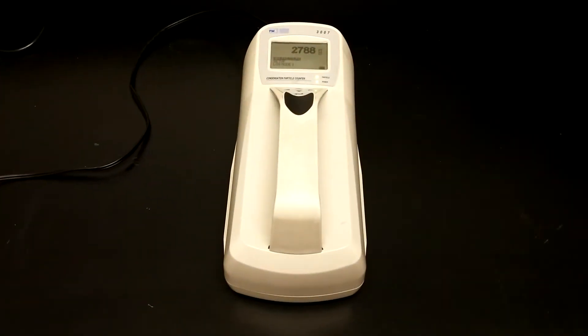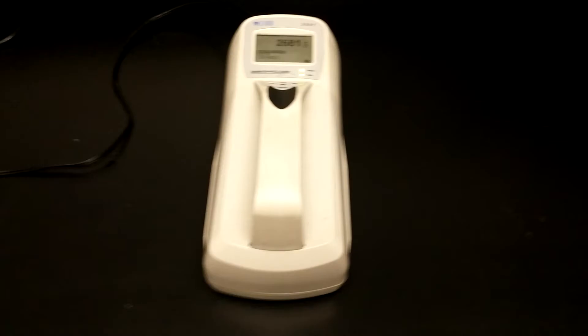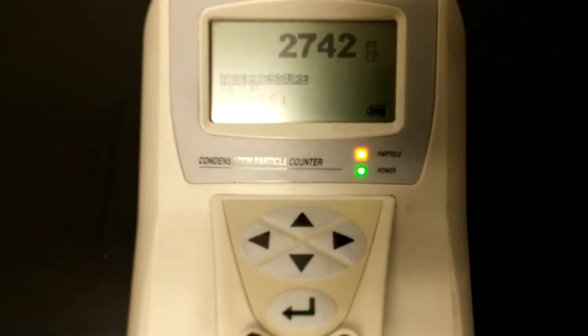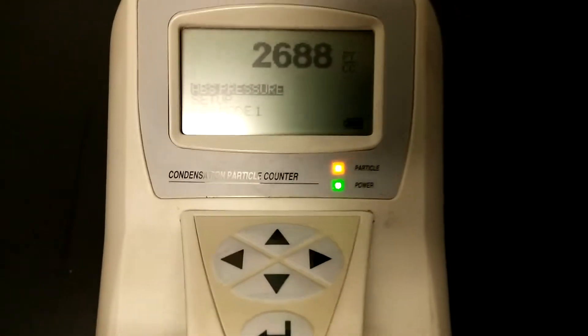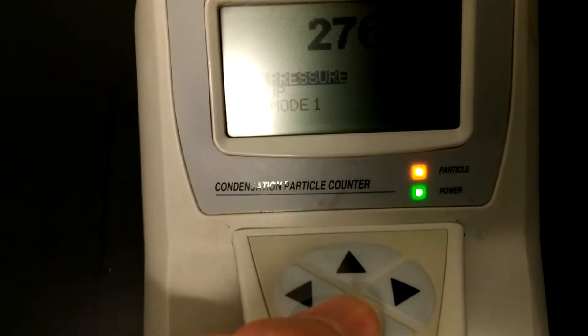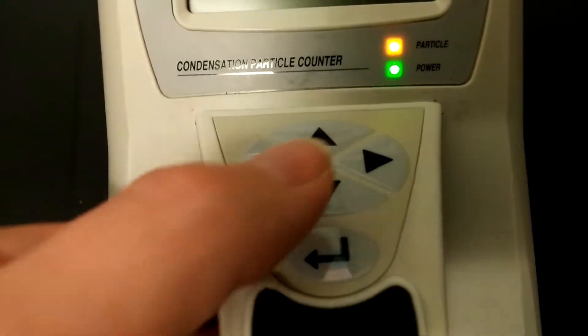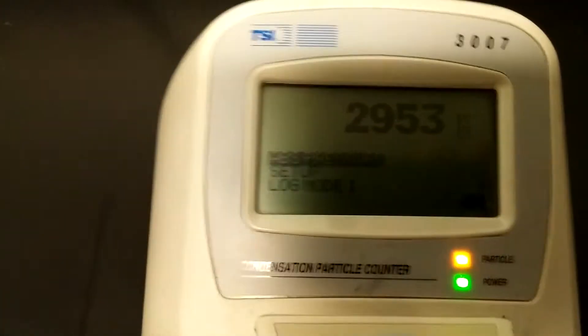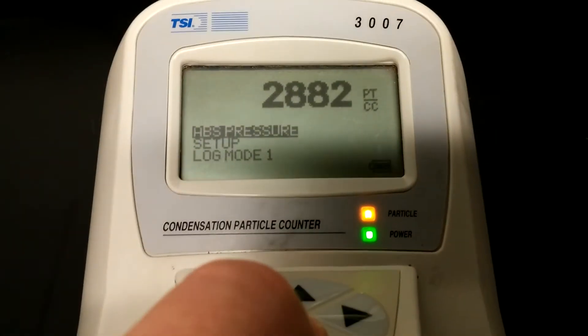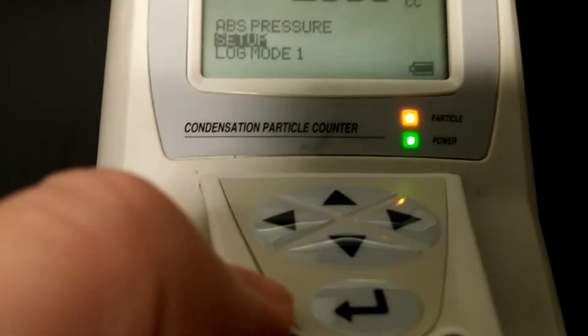Before you start sampling, it's very important that you make sure your logging interval is set correctly. To do that, once it's powered on, go to the main screen and click the down arrow until 'Setup' is selected. Press it once and then press the center button.